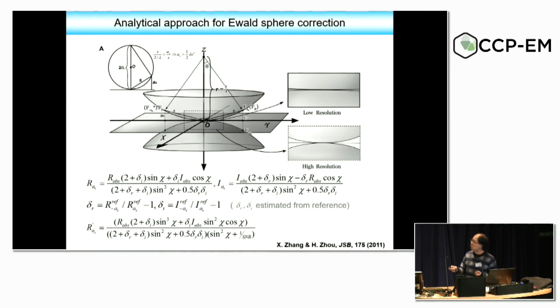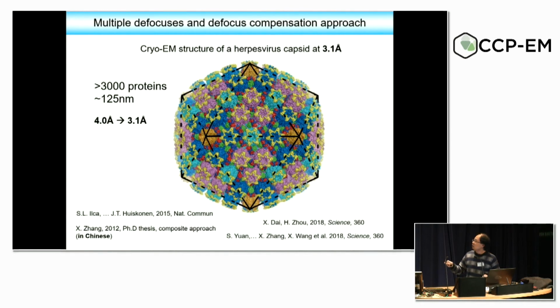and I think there is still something we can do to slightly improve that by considering the signal-to-noise ratio, because in this approach you will have the problem of zero values of the denominator here. So we need to consider that.